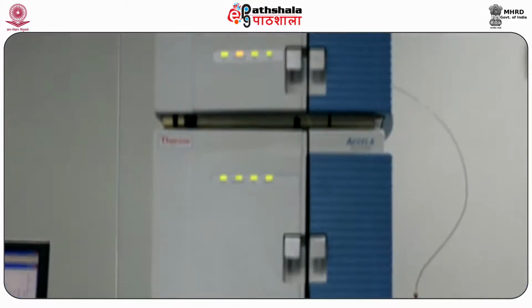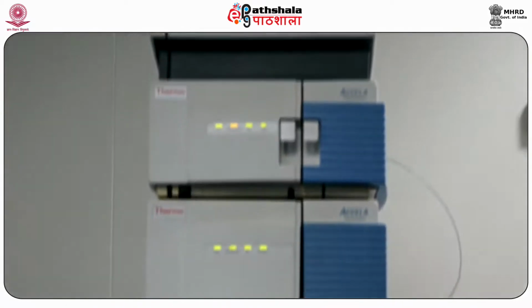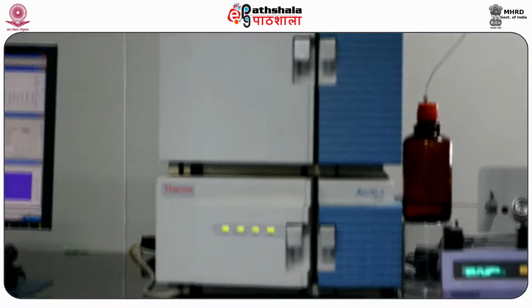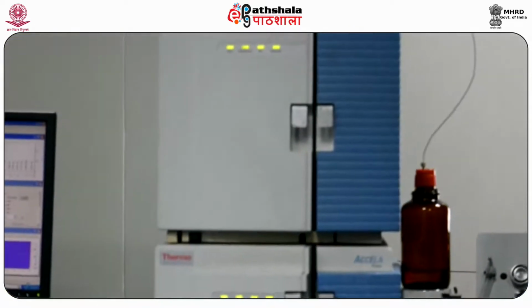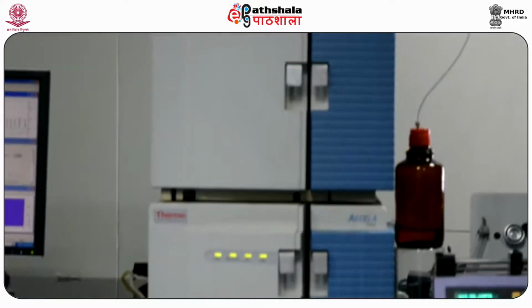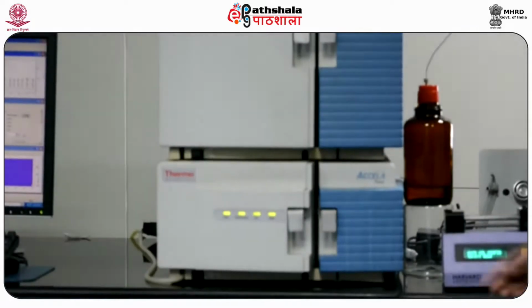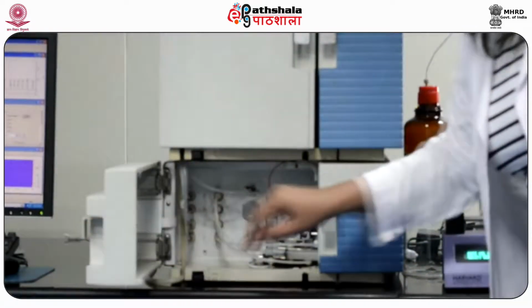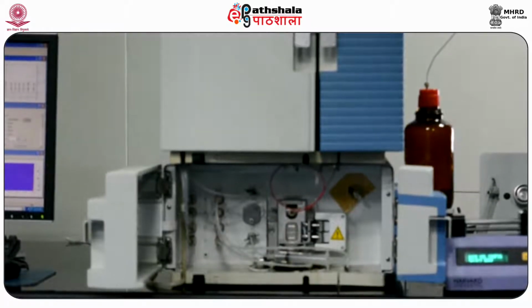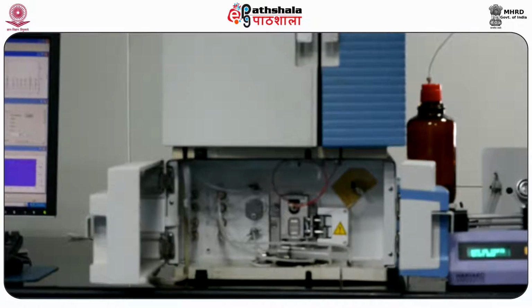What you see here is the modular HPLC, which is a completely integrated one. It has three distinct components that are lined up in series. The lowermost one is the pump, where the solvents coming from the top are pumped by the reciprocating pump at a particular pressure.